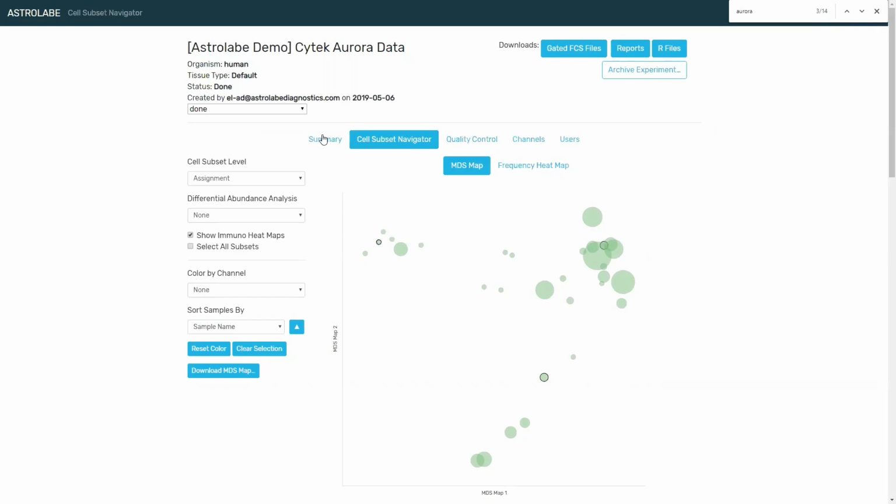So the next question is for Cytek, and that is, what is the difference between compensation and unmixing?